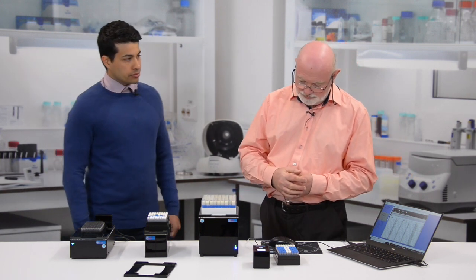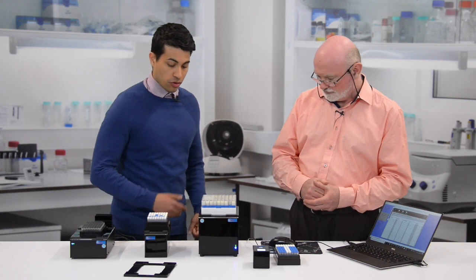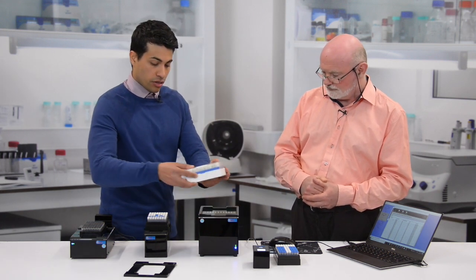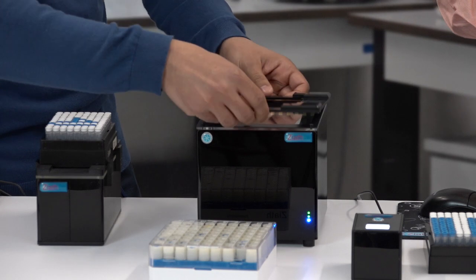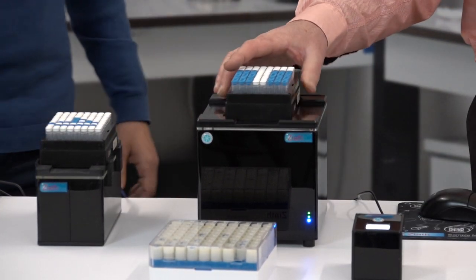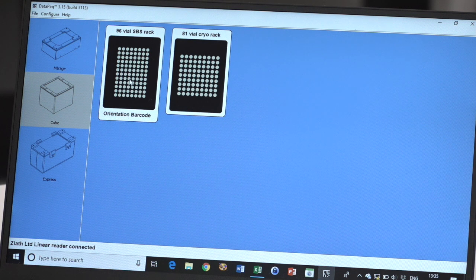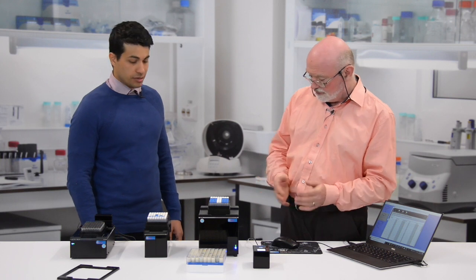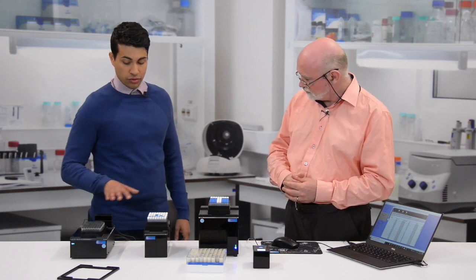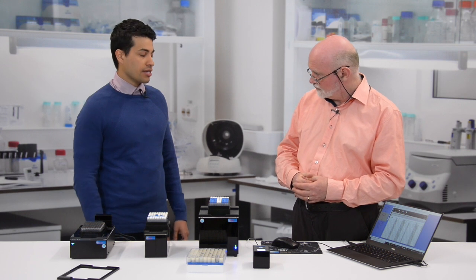So that's the cryo boxes. If I want to change back over to SBS racks, all you have to do is change the mask — take your cryo box mask off, remove the mask, put the SBS one back on, place the SBS rack on, click that into place, and then go back in the software and select the SBS rack from the template. It says 'Capturing Image' and there we go — all the barcodes decoded. These scanners scan in around one to three seconds due to the CMOS solid-state camera technology.